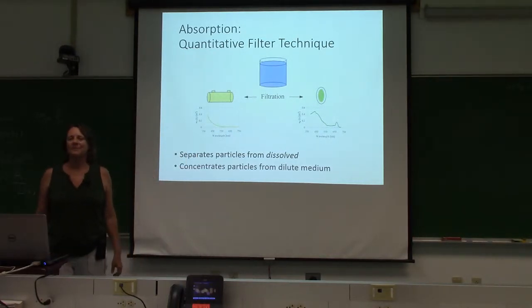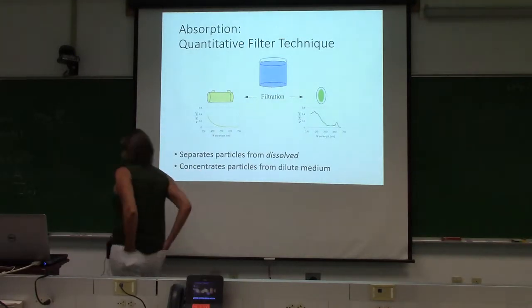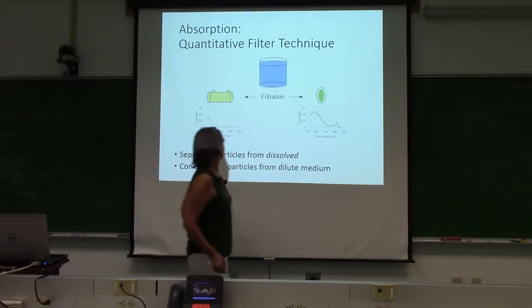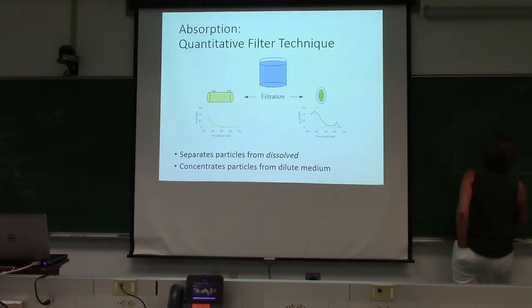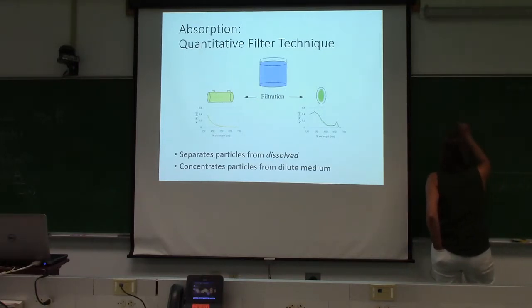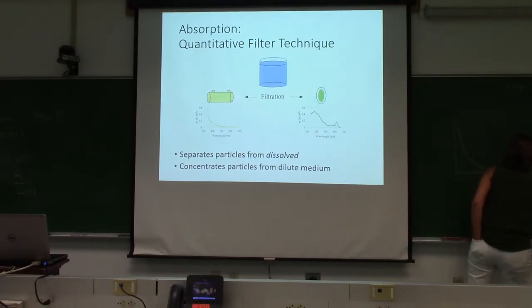So how many people have done this? We have a few students who have already done it. If you get a curve of CDOM that does not go to zero in the near infrared, what do people typically do? Somebody said subtract out the near infrared. Have you done it? Have you seen it done? I've never set it to zero in the 800 or something. If you force it to be zero, yeah.